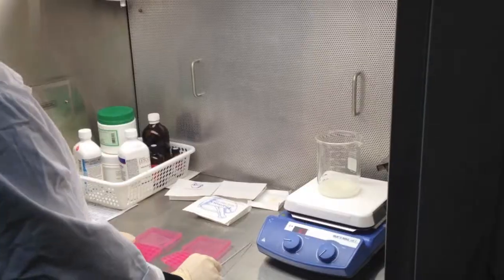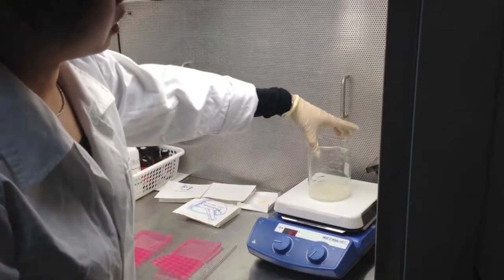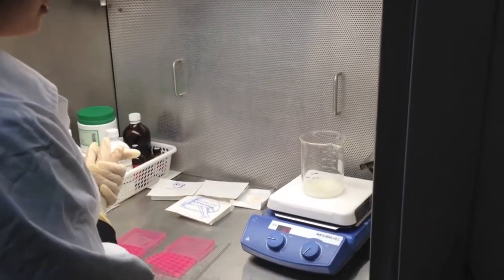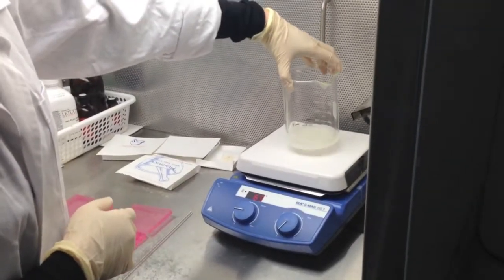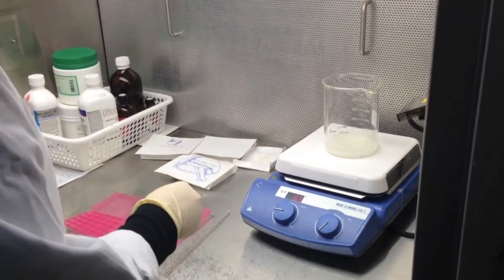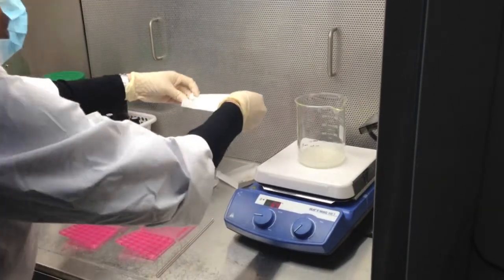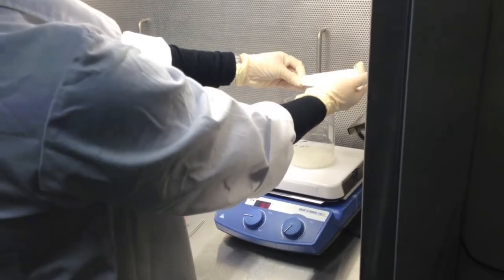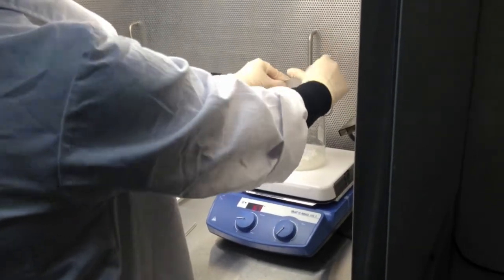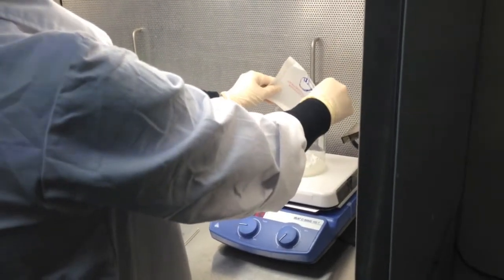A troche is effectively a lozenge and is one of the most popular methods for administering bio-identical hormones. Troches are probably the most suited form of natural hormone replacement therapy mainly because of the ease in which the ingredients in each prescription can be altered and because of their superior transbuccal absorption.